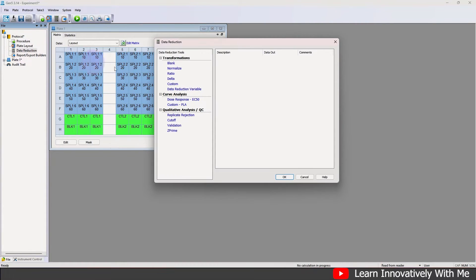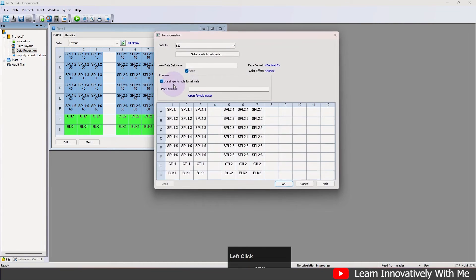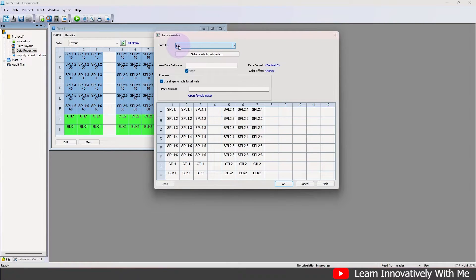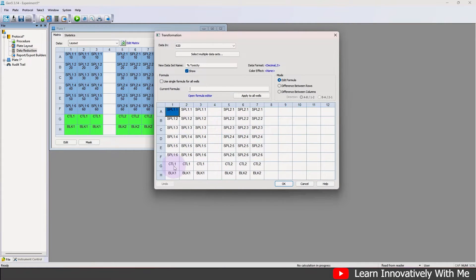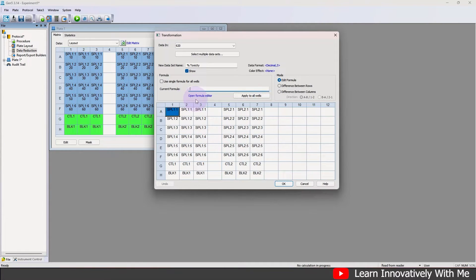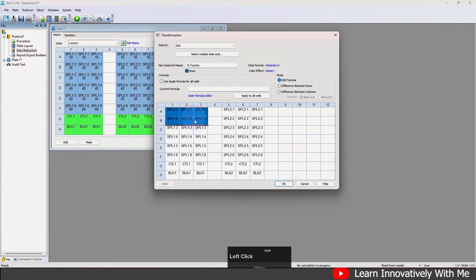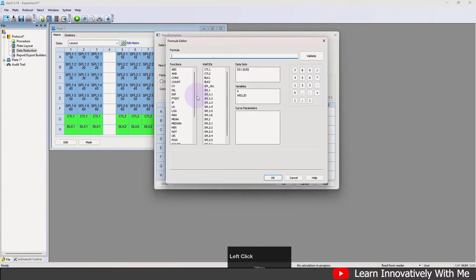After plate layout, click on data reduction. Click on 'Custom Transformation' and select the data input — I'm going to select 620 nanometers, but if you have a reference wavelength use the subtracted value. Provide a name for this transformation; I'll name it 'Percent Toxicity.' Uncheck 'Use single formula for all wells' because we have two types of samples with their respective positive controls and blanks, so we cannot use the same formula for all wells.